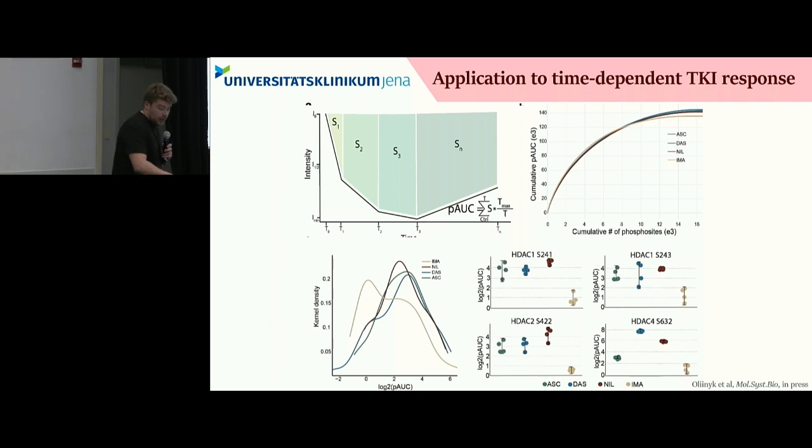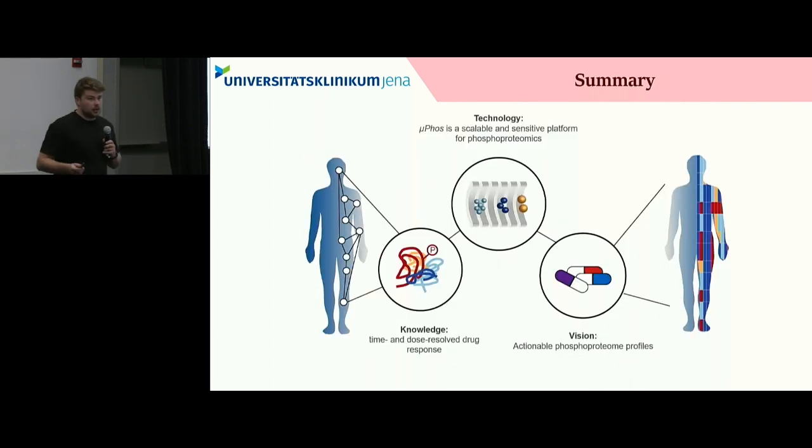So to sum up, I would say that with fast instrumentation, very quick and very reliable analysis with Spectronaut, and high sensitivity and high throughput sample preparation, automated or manual, we are now able to achieve very high throughput phosphoproteomics that opens a lot of very exciting applications that we are envisioning in the next couple of years.